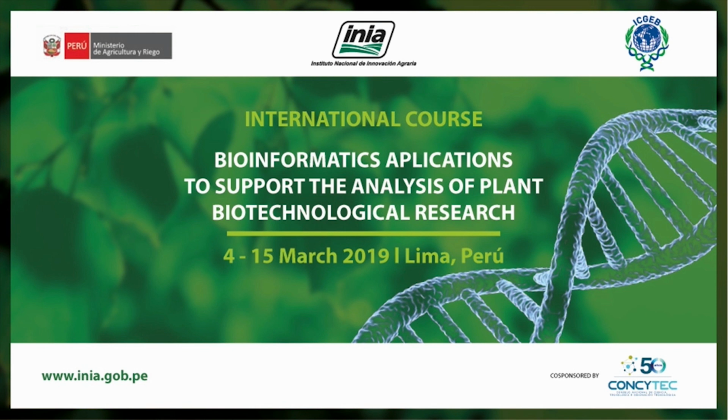I think you already have a good idea of what the colon, period, and asterisk mean in the consensus. So I can just move it away. Pretty obvious. I wasn't sure. No, I mean, when you look at it, you see that you have an asterisk at 100%. Oh, yeah, the asterisk, yes, but for the period and the colon, you have to actually look into the line and see, look at this, TAFLL, LLLIIL. So I think it probably has something to do with the percentage, but exactly where is the threshold? I prefer to just look at it. Yeah, you're right.